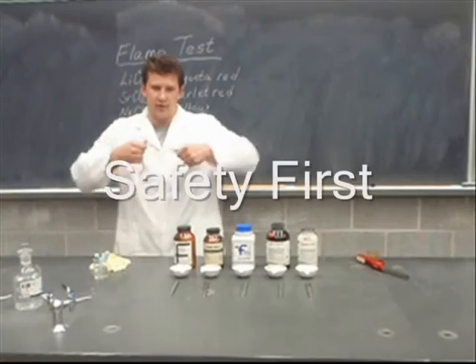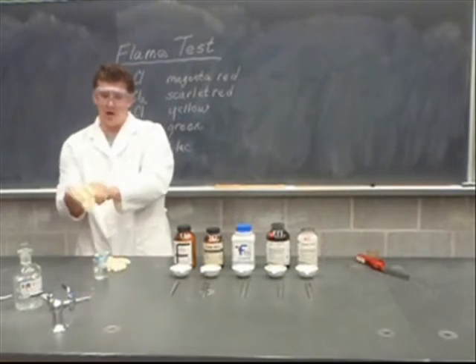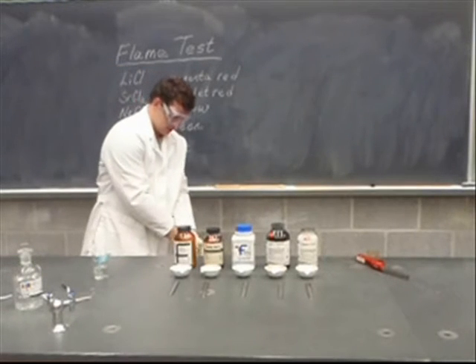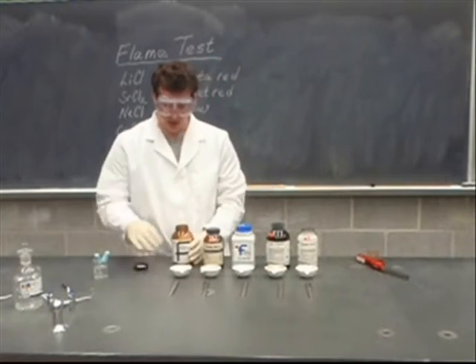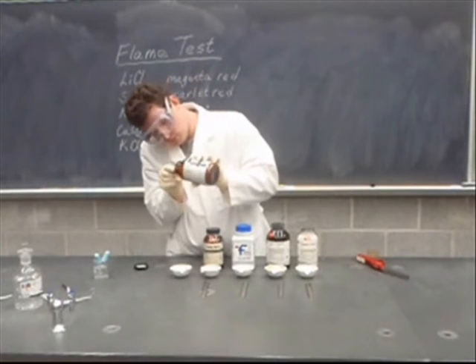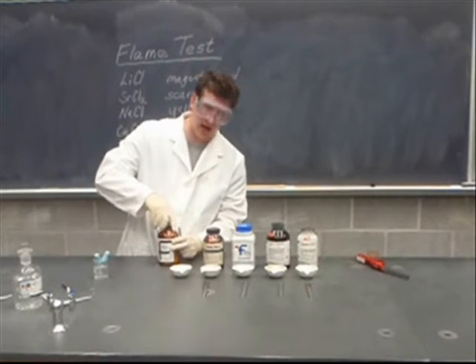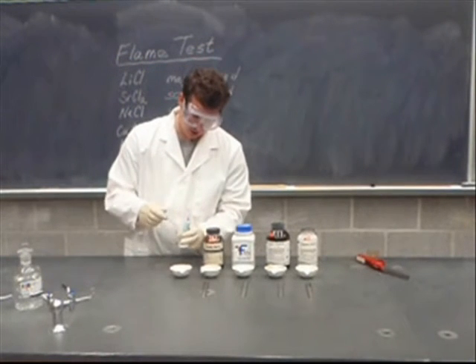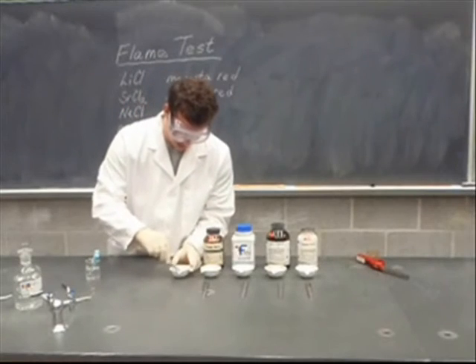So first thing you've got to do before you do anything is make sure you have your safety equipment on. Goggles, and whenever you work with any chemical, you should always wear your gloves. Now, what we're going to do is add a little bit of each compound into each bowl. When you finish adding a compound, always move it out of the way, especially when you're going to be using open flame, which we are later. Add a little bit of water to dissolve our compound.